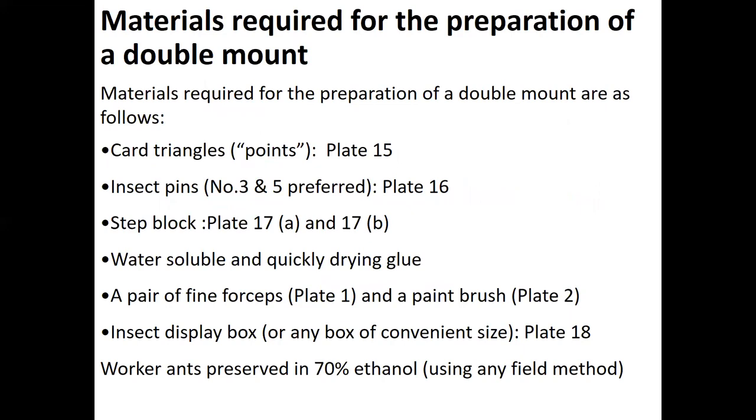Right. Here we are looking at the materials required for the preparation of a double mount. We usually double mount ants, so we need materials for the preparation of a double mount. We usually do this in the laboratory, giving the participants a chance to develop the practical skill on their own, right? But this year, unfortunately, we cannot conduct that laboratory session. Only the online lesson is here.